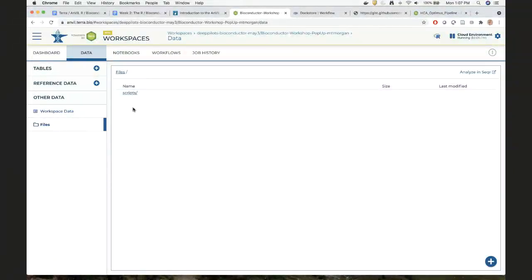The name persistent is confusing me. Is it persistent like it's always there, or does it go away when I stop? In many ways, I think we should rename it, like a local disk or a computable disk. It's the thing that you can perform computations on, but it's relatively expensive.